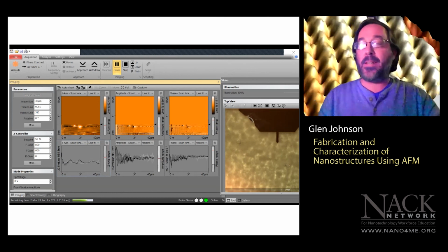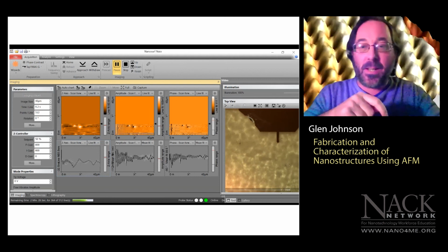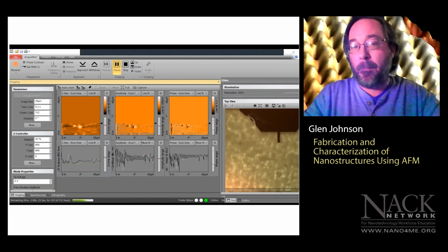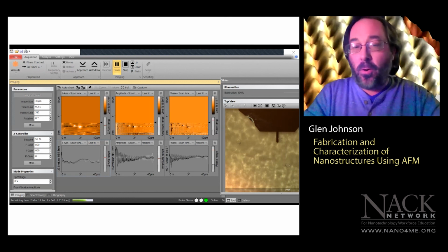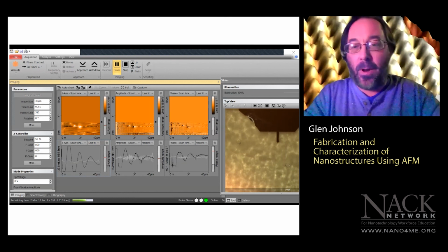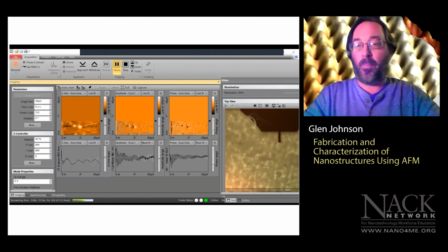So remember what the phase is actually doing. It's tapping the surface and it's asking, is this hard or is this soft? And it's going to show us with contrast. So if you look at your topography, we see a nice bright area right here. So it's tall. We can also see it on our deflection scan, our amplitude, but we'll ignore that for now. But on our phase, we can tell that it has a different stiffness than the surrounding PVP.